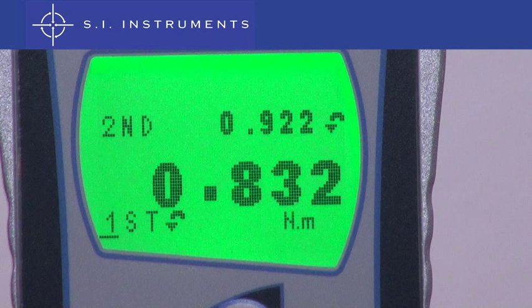On the display, the initial peak of 0.832 Nm shows the seal crack torque. The second peak, 0.922 Nm, is the tamper evident bridge crack torque. These values are perfectly within manufacturer specifications.